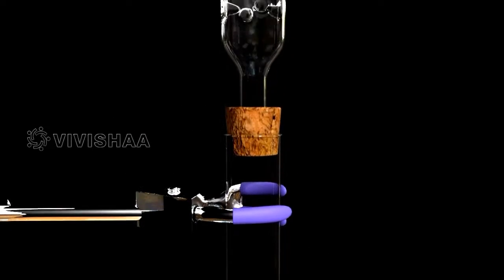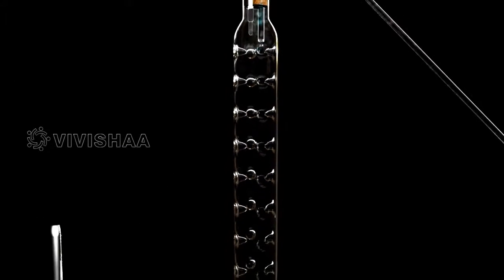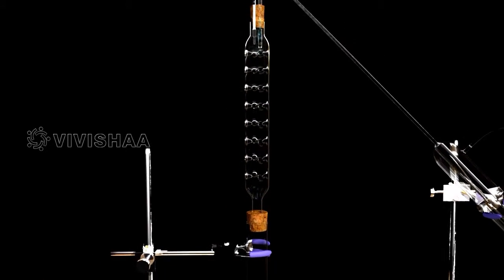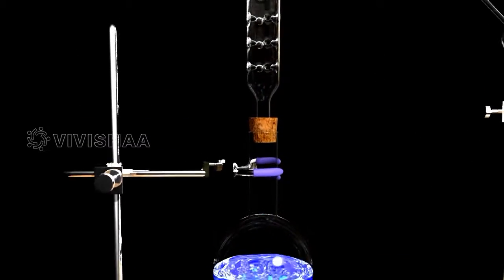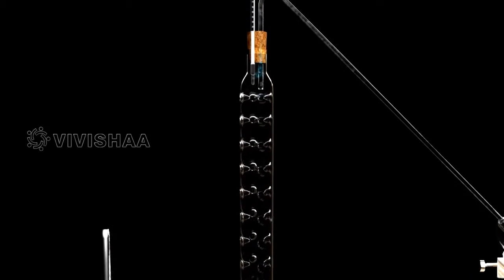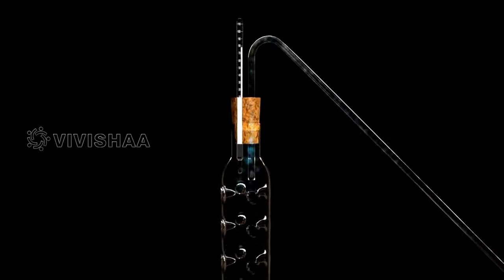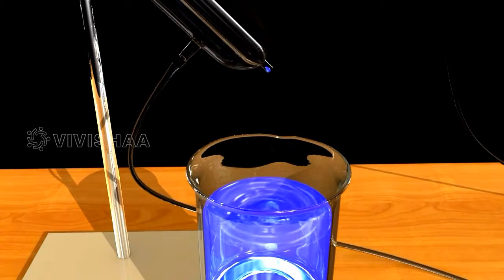Ethanol vapors rise up and condense in the fractioning column and vaporize all over again. After a continuous cycle of vaporization and condensation, ethanol flows through the condensing unit and gets collected in the collecting vessel.